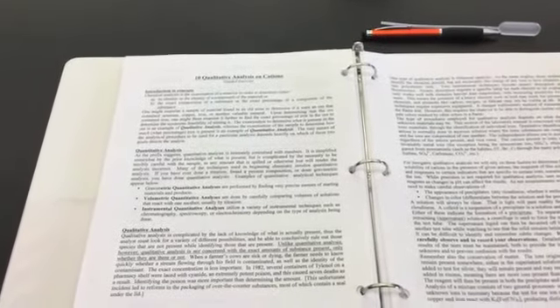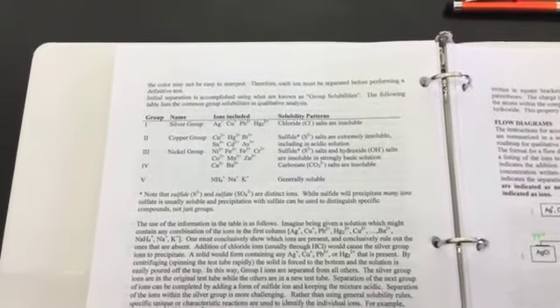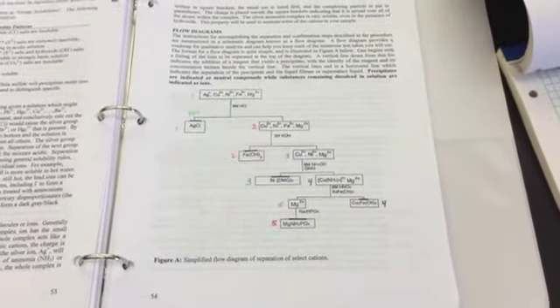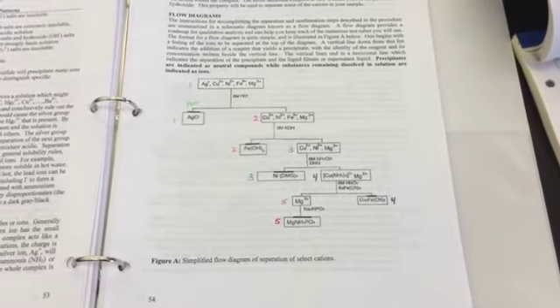Before beginning your lab, you're going to want to read the directions in your lab manual. Read carefully about all the different techniques that you will be using and pay attention to the pre-lab considerations in the lab manual. You will notice that there is a description of the different groups and what kind of solubility patterns they have, which ions are in which group, and so forth. There's also a flow chart that will show you how we are going to separate the different ions. I have placed numbers next to each of these. These numbers will be labels for the test tubes that I am using.